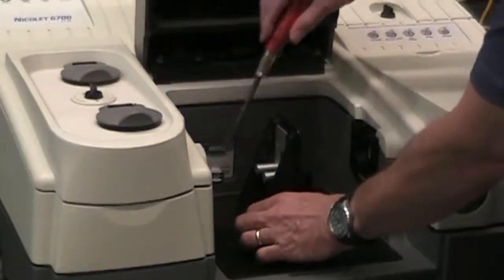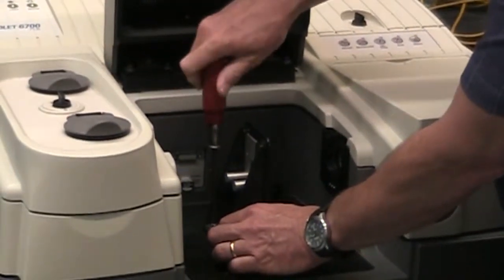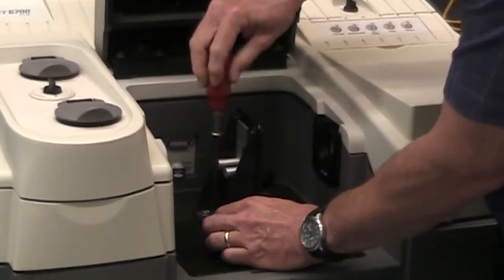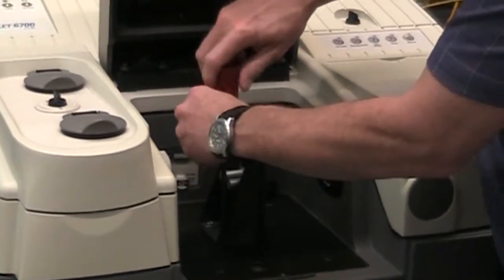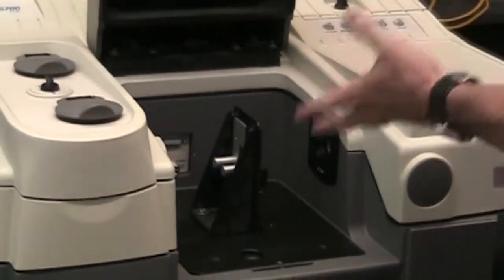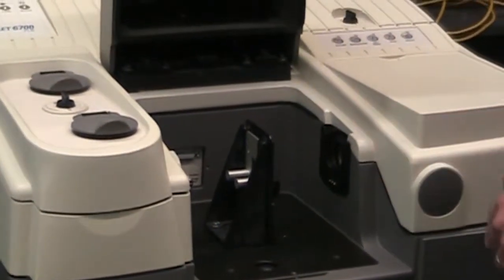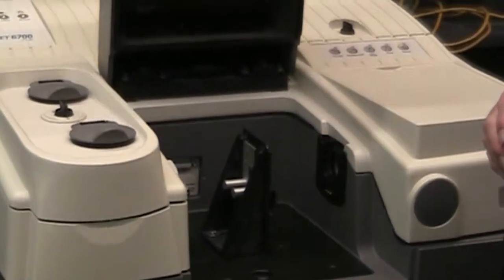And the screwdriver just to tighten it down so the sample doesn't move during the course of the experiments. So again, just to reverse the removal process, we put it back. This is kind of the standard position, so it's kind of a courtesy if you leave the instrument in this setup.